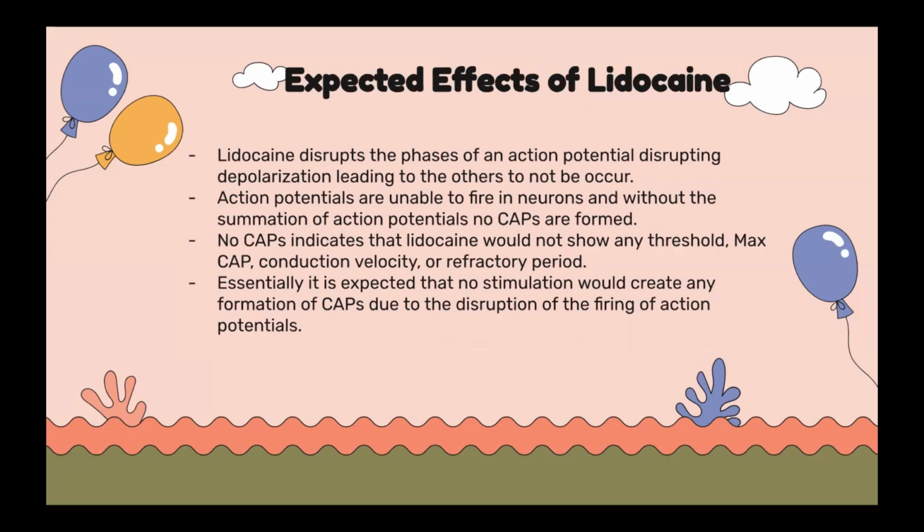Due to no action potentials being made, a summation of action potentials cannot make CAPs. And because there are no CAPs, it is expected that lidocaine would show no threshold, no max CAP, no conduction velocity, and no refractory period. Essentially, it is expected that no stimulation would create any formation of CAP and any data recorded.